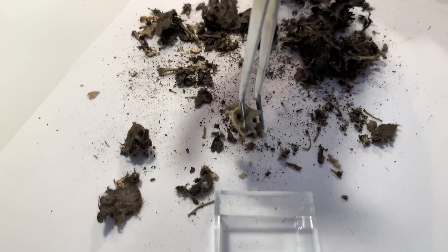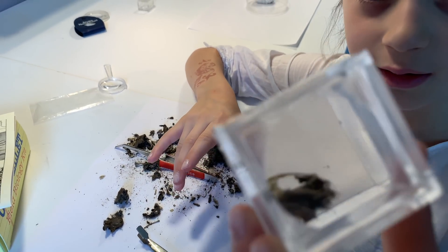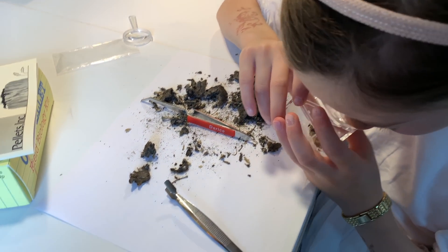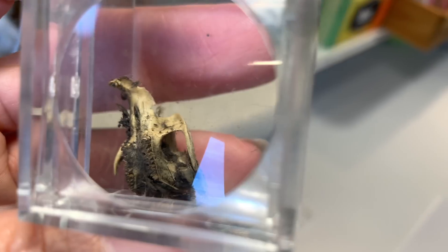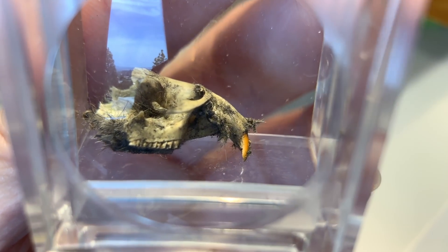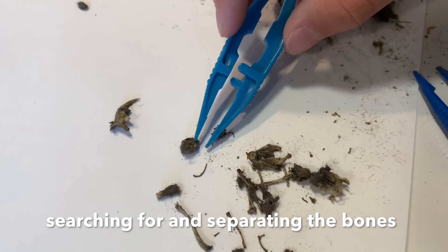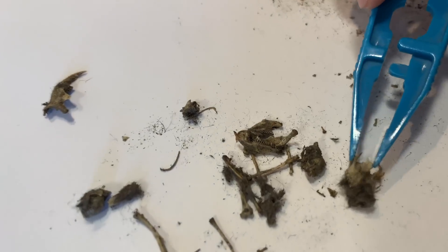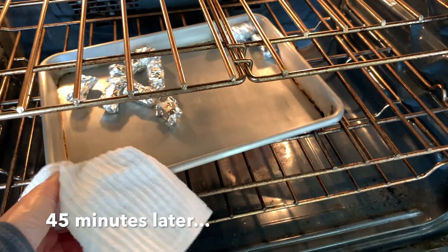We also have some magnifying glasses and this really cool kind of cube so that you can look at your little object without touching it at all — it has a magnifying glass on top, which was really neat. Very quickly we find some pretty interesting things in these owl pellets. That is a skull! There are a ton of bones and you want to be careful about separating all of them. First you go through and find all the big stuff, and then later you find the smaller stuff.